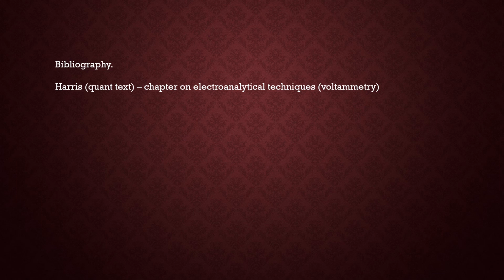In referencing any of the textbooks that you've purchased, what I've recommended for the course has a specific chapter on voltammetry. The older books will have a chapter on polarography and voltammetry. But I will also point out, for those of you who've kept your textbook from quantitative analysis, that Harris has a very good chapter on the subject. The chapter title is Electroanalytical Techniques, and there's a section specifically devoted to voltammetry. For references on the electrodes and the Nernst equation in particular, the previous chapters in Harris have all that material.